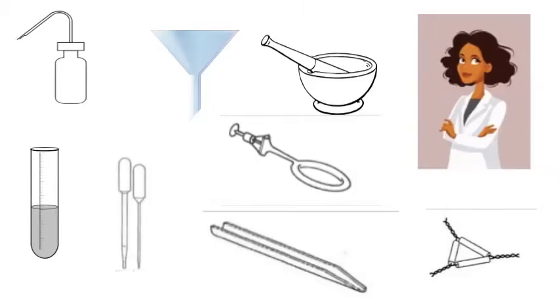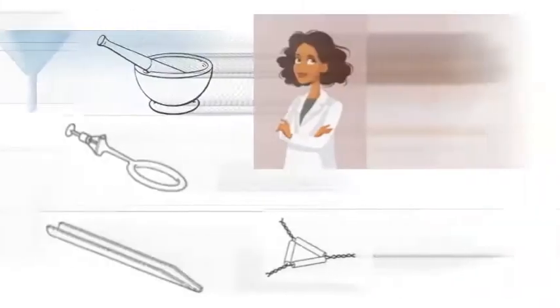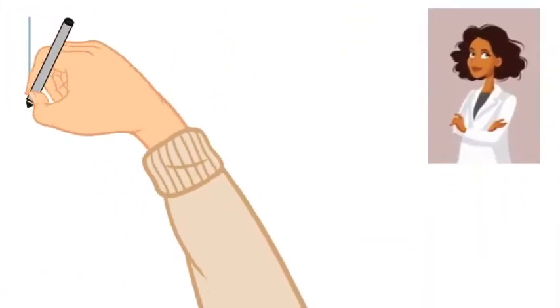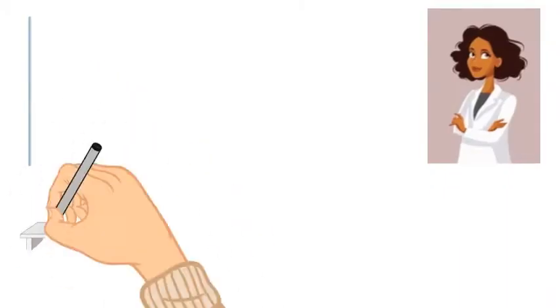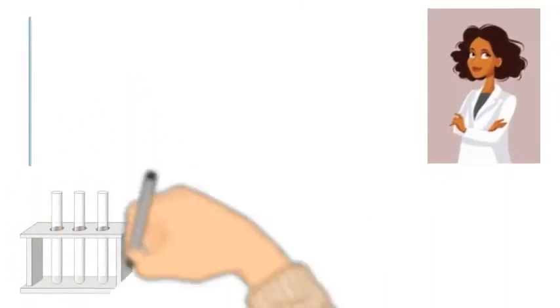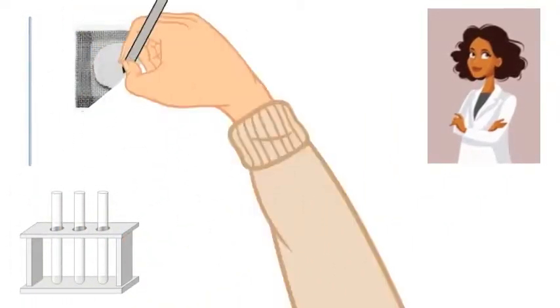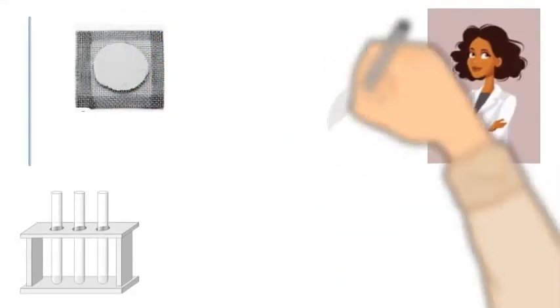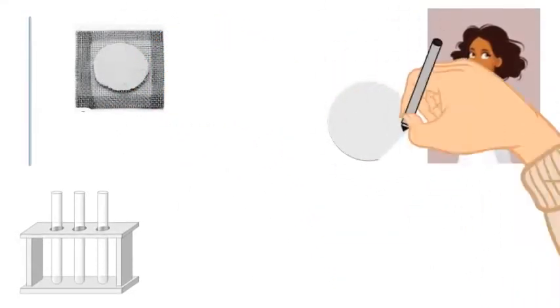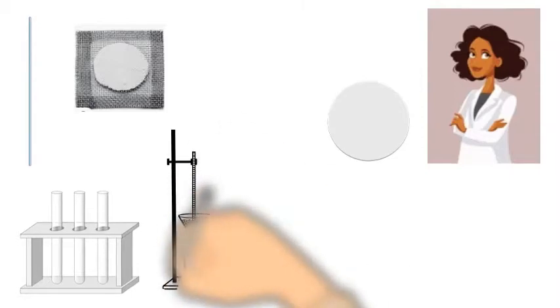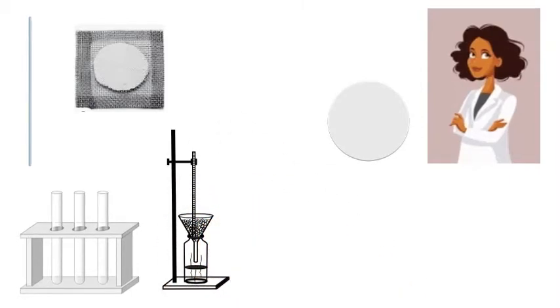The next set of equipment is the stirring rod, it's usually made of glass, and then the test tube rack to hold the test tubes. We also have the wire gauze so that when you put hot things on the desk the hot thing can be protected. Then there's the glass watch glass.